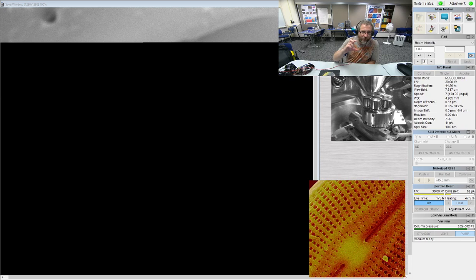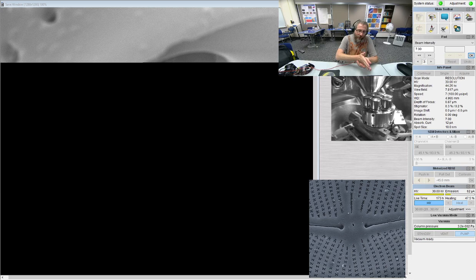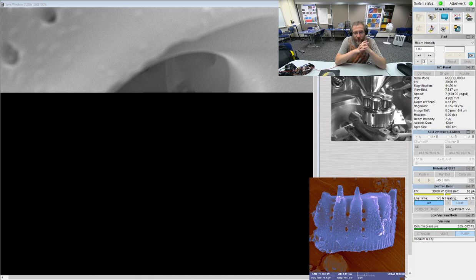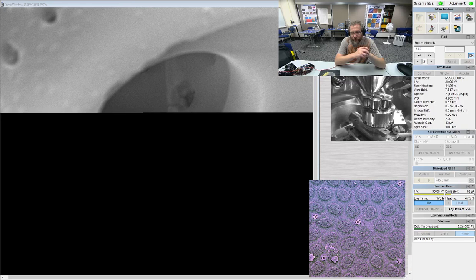If you're wondering, scanning electron microscopes scan across the surface. They hit the surface with an electron beam, and then electrons are ejected from whatever they hit as well. Those electrons coming in will hit electrons in the specimen and eject them from the outside of the sample, and they're captured by the secondary electron detector. Those we call secondary electrons. It moves along point by point, knocks out electrons, and captures the ones that come out of the specimen.